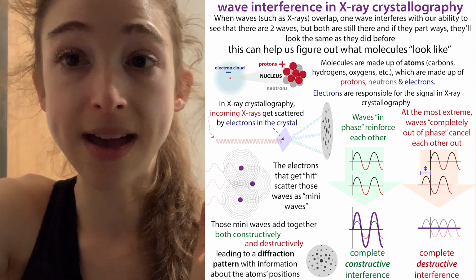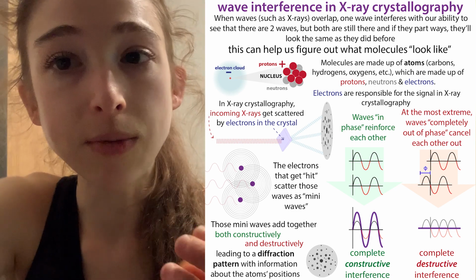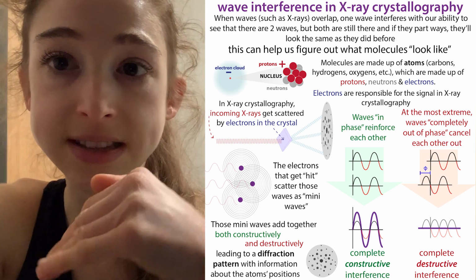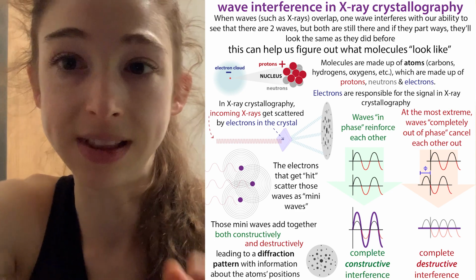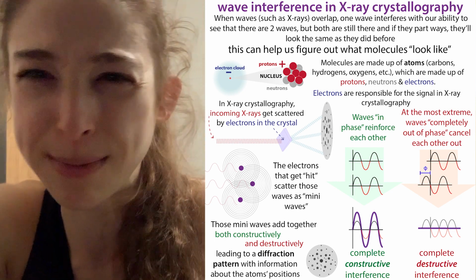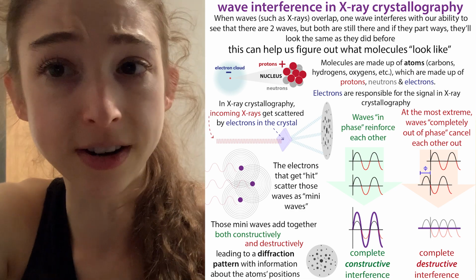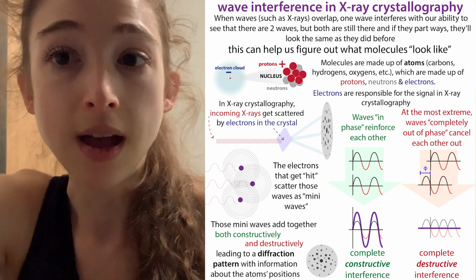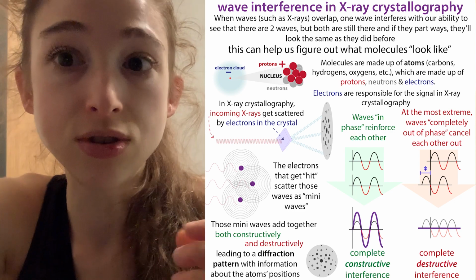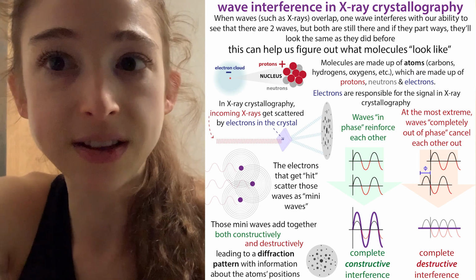So just like you could have a wave like this, or you can have a wave hitting like this. Basically, what happens is you don't have the phasing. You don't know if it's in step, what part of the step those waves are on. Hopefully the image makes it clearer. But basically, to deconstruct that mega wave from that pattern of spots, you need to know the phasing as well as the intensity, and you're missing the phasing.